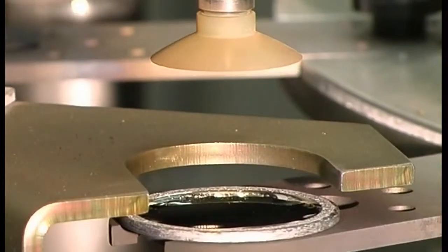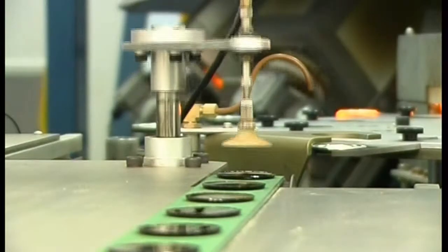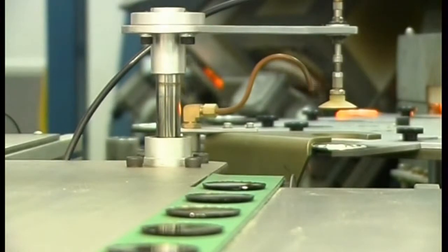The moulds are cooled and the beads are removed and placed on the exit conveyor, ready for testing in the XRF instrument.